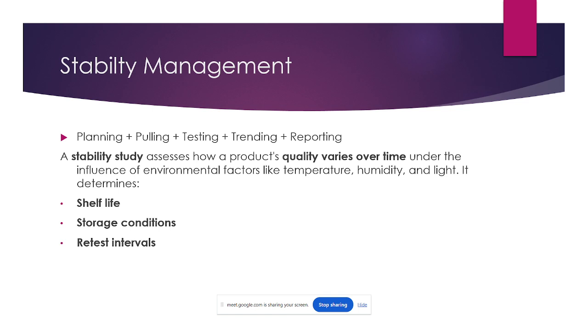So that's why, when the new batch was generated and done, we need to load that batch in the stability chambers. What do stability chambers mean? The chambers will have different conditions, like 25/60, 40/75, or 30/65. So different conditions will be there.